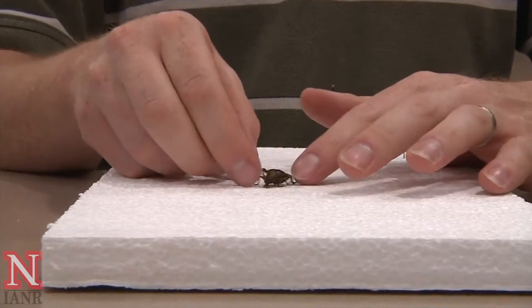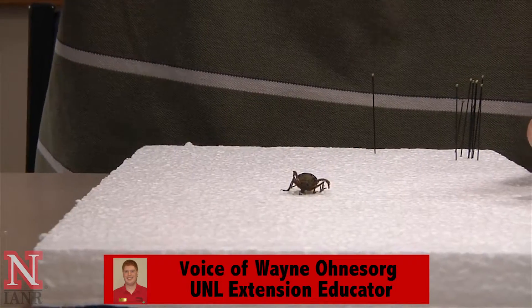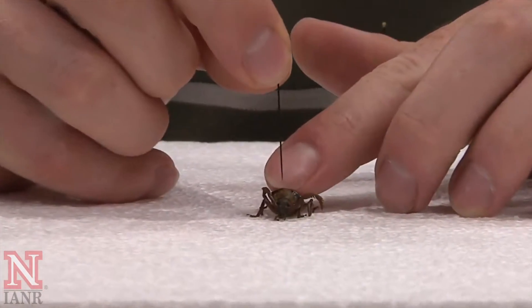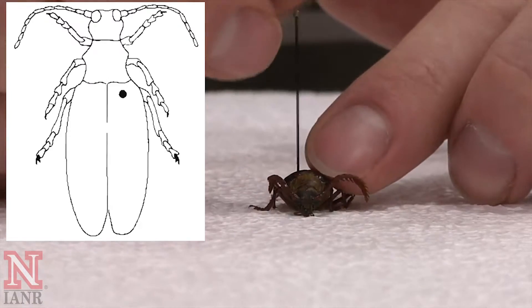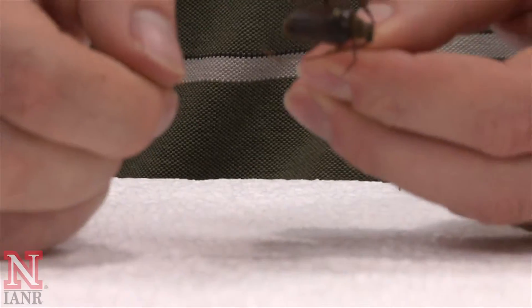Welcome to How to Pin a Beetle. In this video you will learn how to pin a beetle for your forage entomology collection. Notice in the diagram that the pin goes in the right elytra in the upper right hand side.